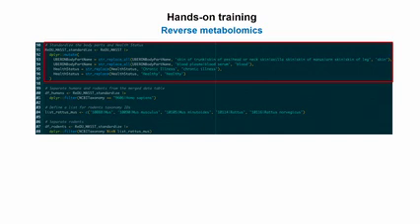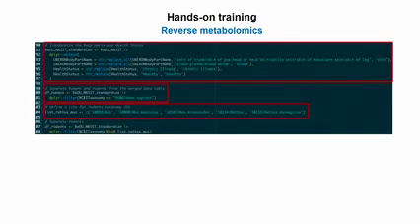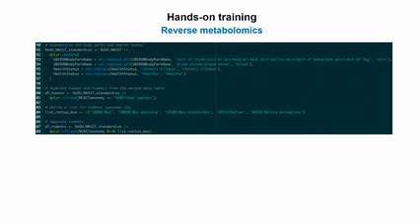And then at the end, what you're going to get is a combined table where you merge all of them. But just before we do that, we harmonize some of the naming again. In the first part here, where you have standardized, we combine all the skin locations to skin. So we have skin of head, skin of trunk, and we just want to combine all types of skin together to skin. Of course, if you're interested in a specific skin location from the redo metadata, then you want to remove that line, so you just comment it.